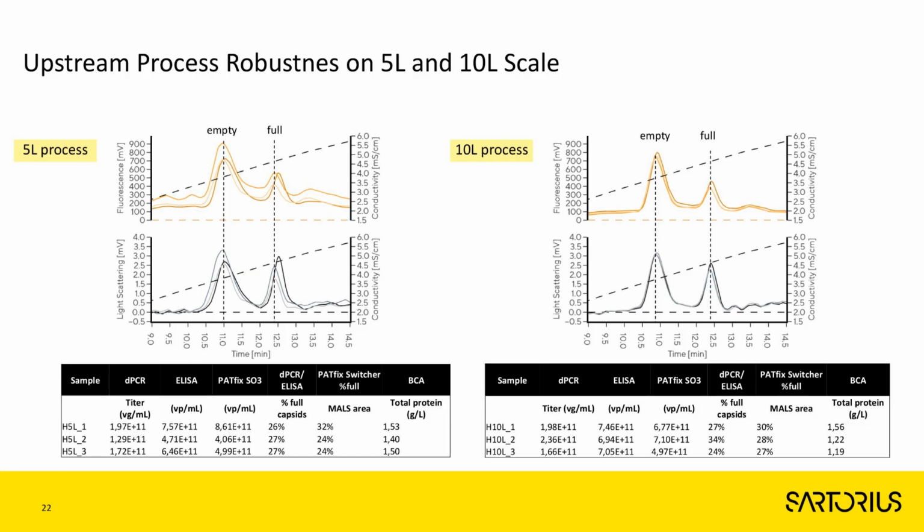The next example I would like to show you, and this is the final example for today's webinar, is how we used this tool to follow our upstream process robustness.